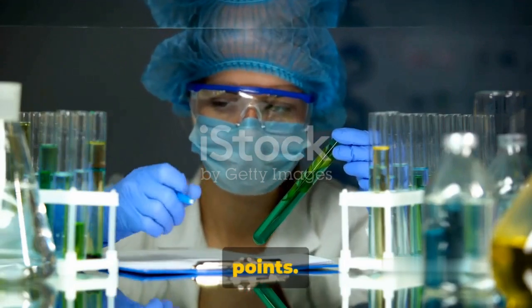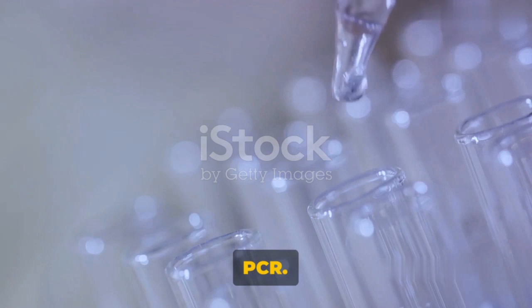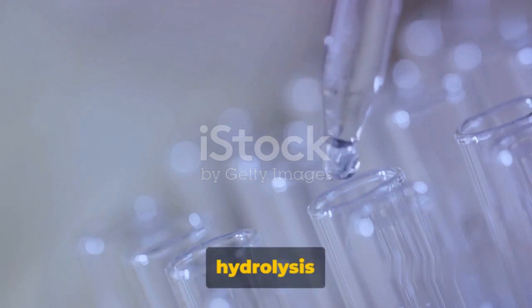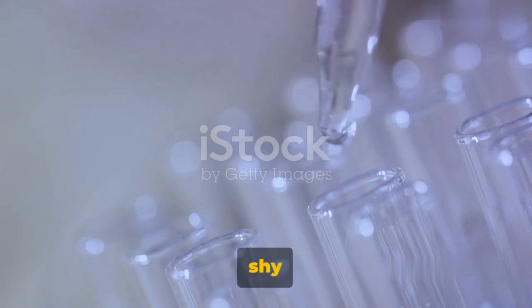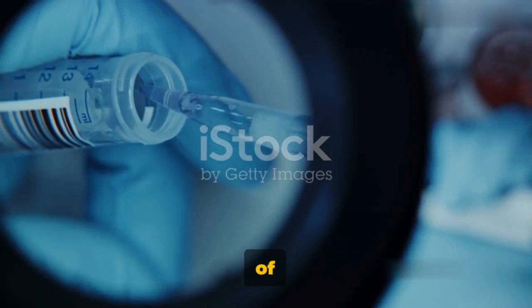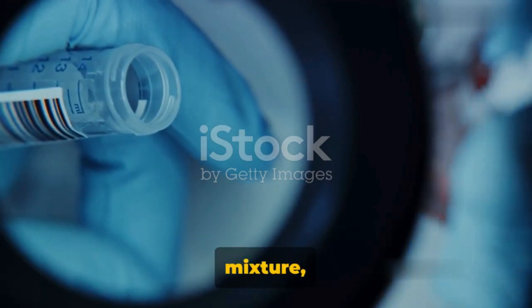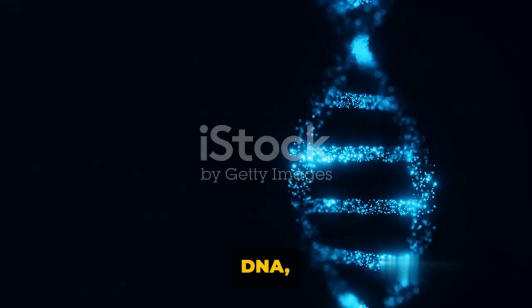Let's now summarize the key points. We've learned quite a bit about fluorescence markers in real-time PCR. TaqMan probes, hydrolysis probes with a reporter dye and a quencher, behave like shy performers under normal conditions. They coil in on themselves, keeping the fluorescent signal of the dye quiet. But when the target sequence is present in the mixture, it's showtime. The probe binds with the sample DNA.